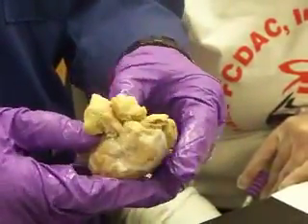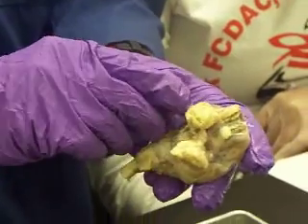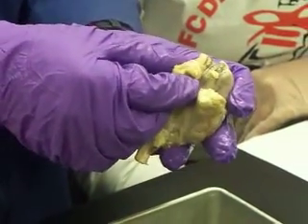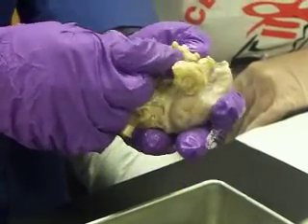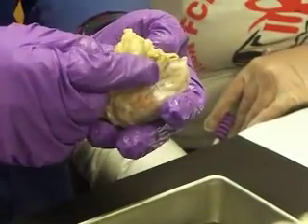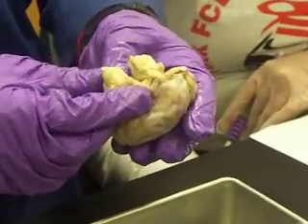Now there are these other structures here too. We have these sort of fatty deposits with some muscle. The fatty is the white, and the skeletal muscle is the more, I guess, tannish color. Those are the muscles that are associated with the movement of the eyes. And actually, this is where the eyes would be. And the eyes have been cleaved out.